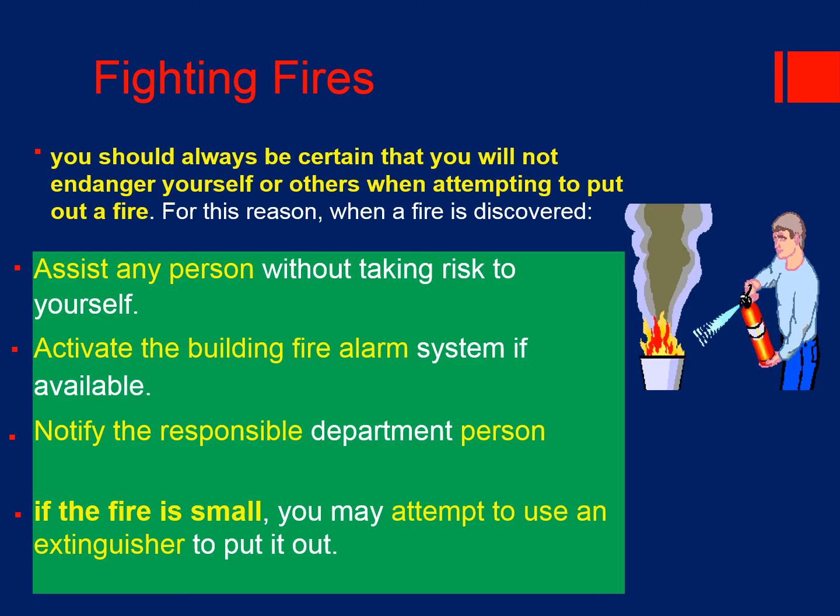And fighting fires depends, right? So always be certain that you have the capacity to put out the fire. If you feel that you cannot handle it, then let the people who are more familiar with putting out fires work on that fire, right? So don't take any risk if you cannot assist. If you can assist, you can assist, but make sure whether it is possible to assist, right? So activate the built-in fire alarm system.